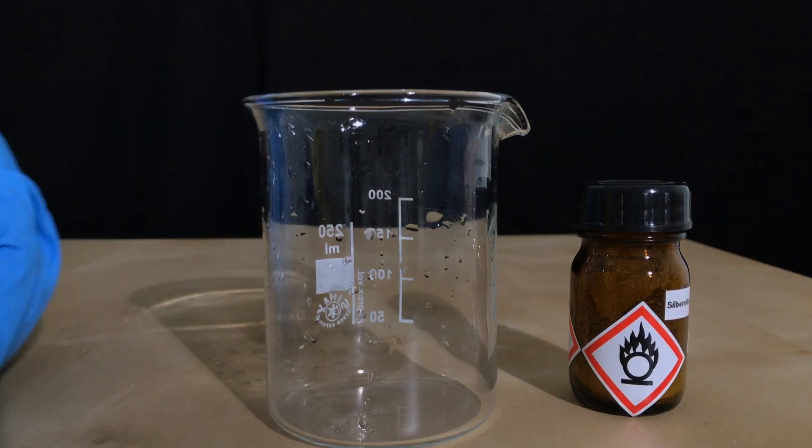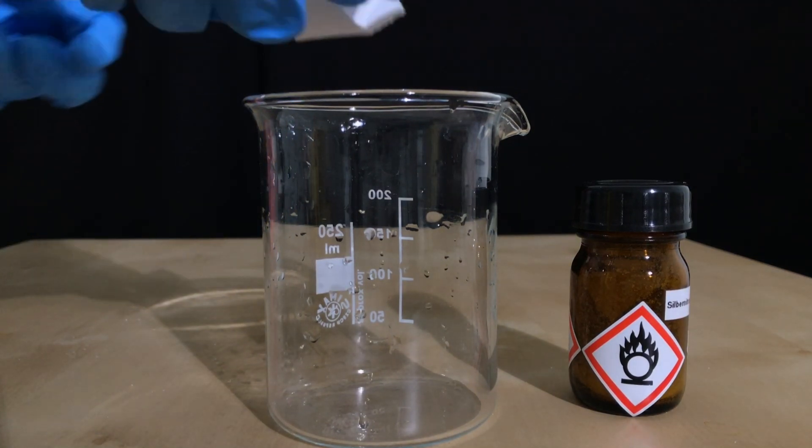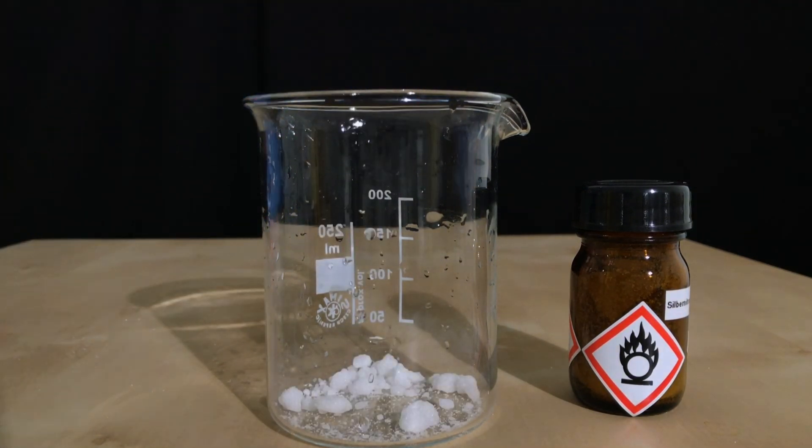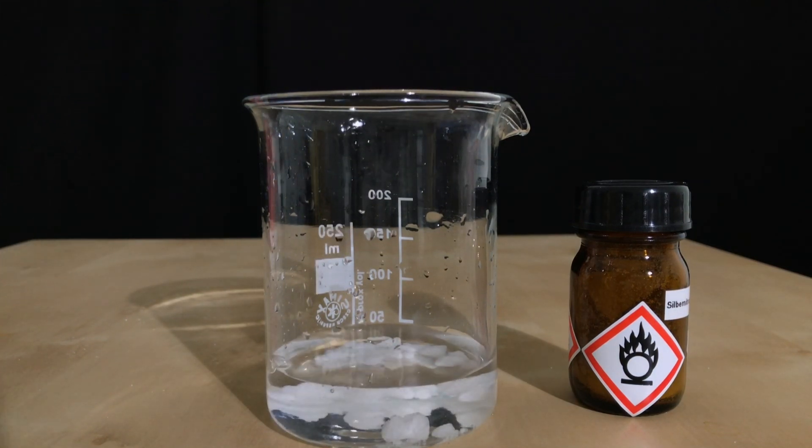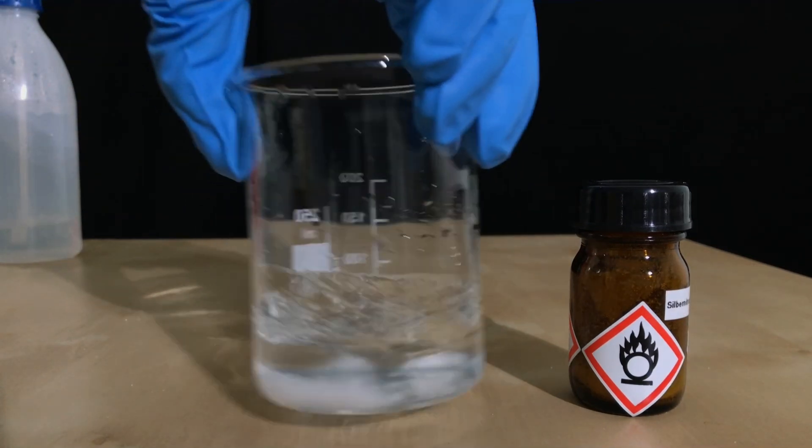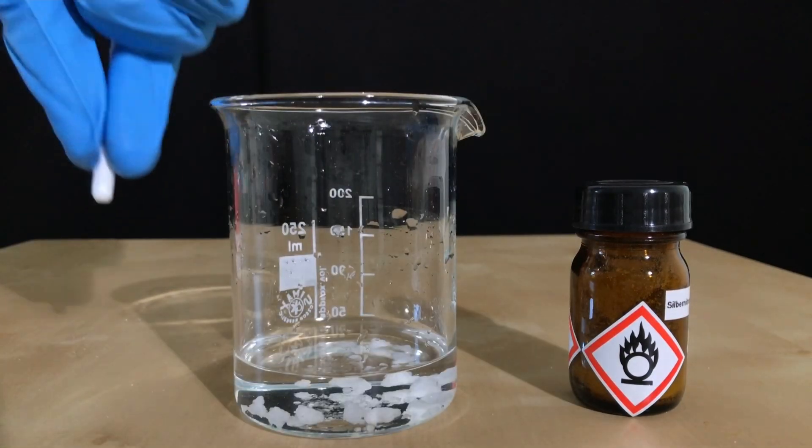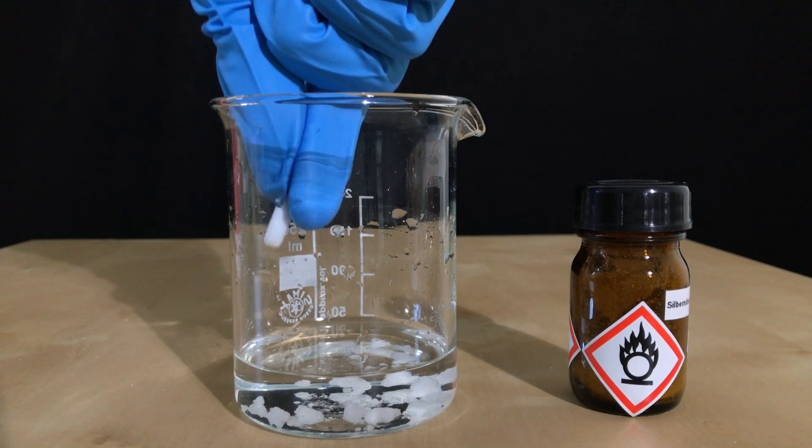To be able to continue with the experiment, we need to dissolve the silver nitrate in some distilled water. Therefore, we added it to a beaker, followed by a bunch of distilled water. The exact amount doesn't matter, as long as all of the silver nitrate is dissolved. Before proceeding, we quickly dropped in a stir fish.